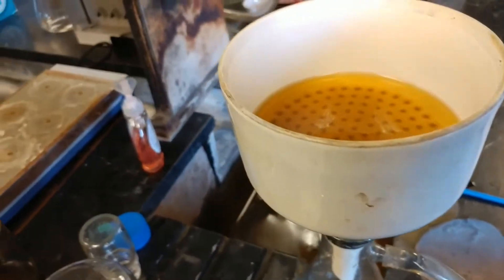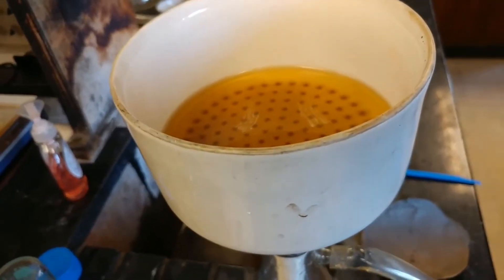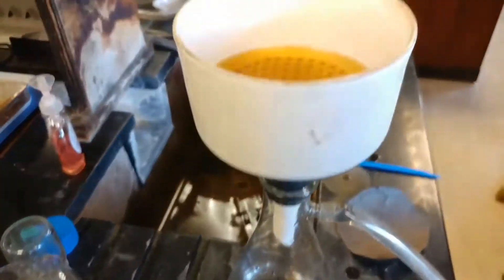I already tried this experiment a little bit and got some results already. So what I'll do is I'll stop now, splice it together, then I'll be pouring this in there and we'll see what the results are.